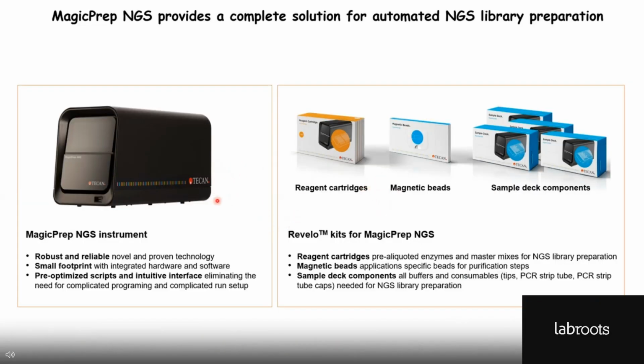The machine recognizes these reagent cartridges. It has magnetic beads and a lot of sample deck components. It has all the things that you need to do a library prep, including tips and tubes.